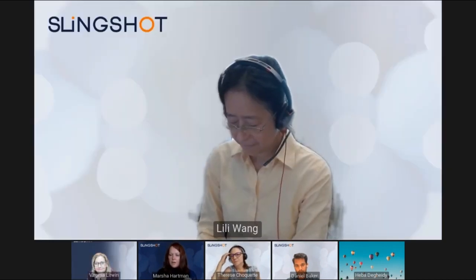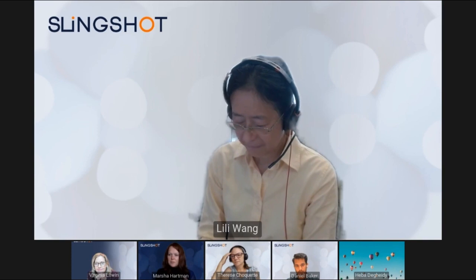Yeah, I do think, Rebecca, your question is very good. I'm going to let anyone else on the panel speak to it, but it brings up some homework for this group: putting those two guidelines next to each other and seeing if they could stand alone or if they actually need each other. I don't know if anyone else wants to comment. I can comment on that, because I think the H62 guideline is, like Virginia said, more recommendations on how you do it specifically for flow cytometry.